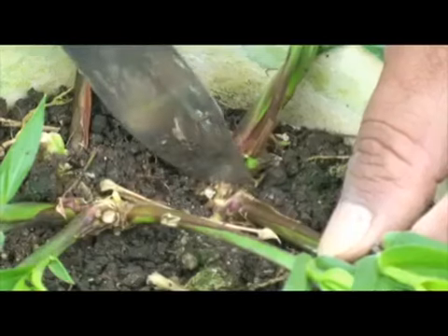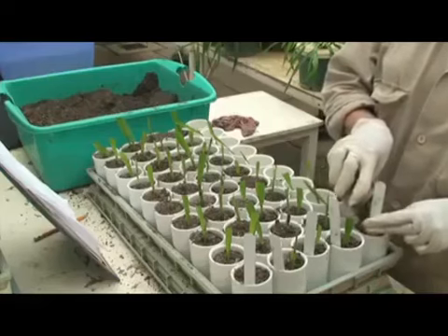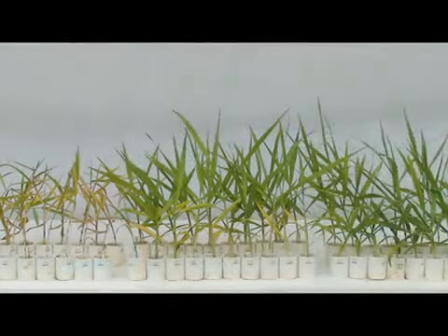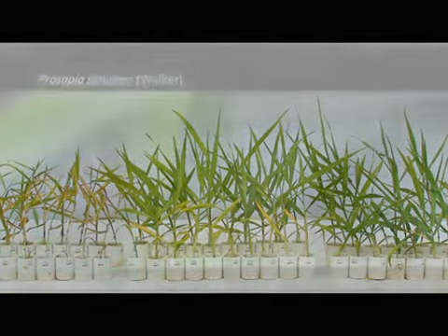The overall objective of this video is to demonstrate a method to characterize mechanisms of host plant resistance to herbivores in support of crop breeding efforts. Our breeding initiative to enhance spittlebug resistance in brachiaria grasses will provide an example.